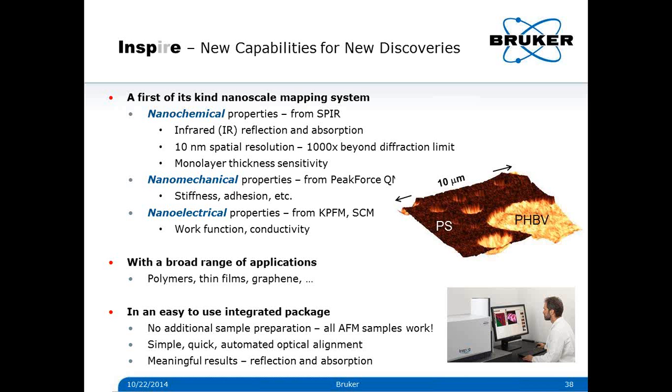Another question: how deeply do you probe with the technique? How deeply into the sample? Yeah, that's a good question. So this technique can go down to 100 nanometer, and it strongly depends on which material you look at. If you have something highly absorbing, where the near fields are absorbed before you reach whatever you want to look at in the 100 nanometer depth, then you have a small signal. You can probably not probe so deeply.